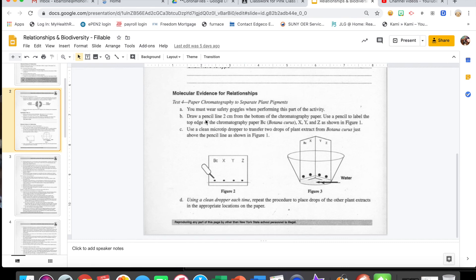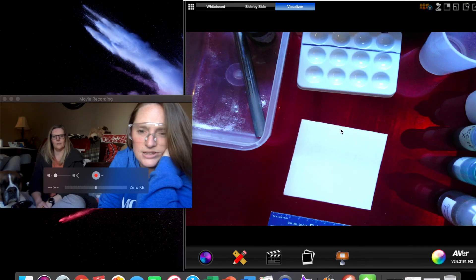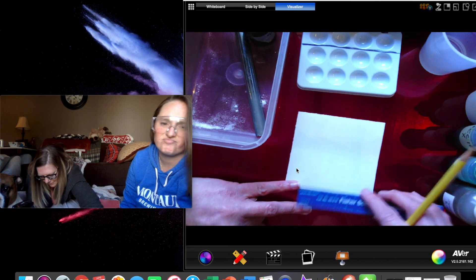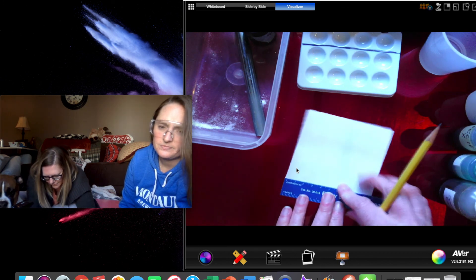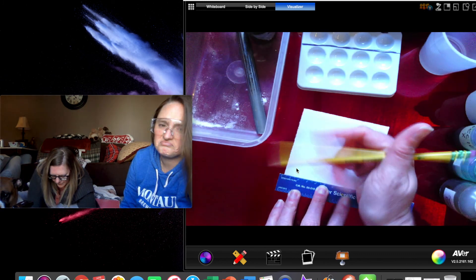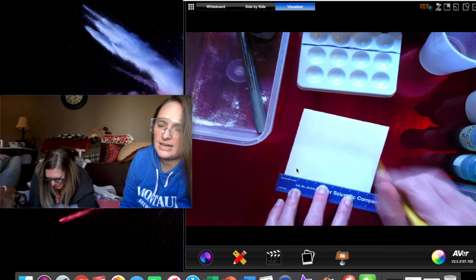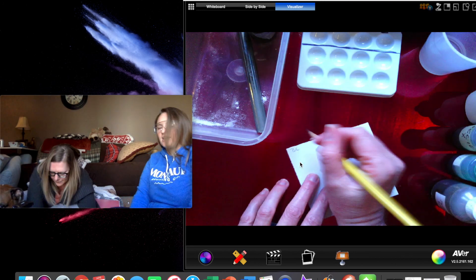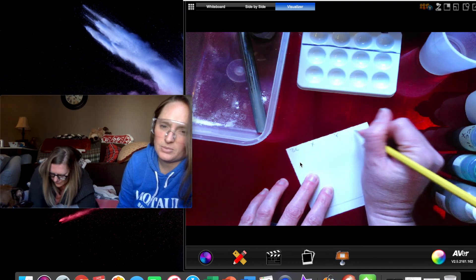Draw a pencil line about two centimeters from the bottom of the chromatography paper, and use a pencil to label the top edge BC, X, Y, and Z as shown in figure one. I'm going to have Jen draw the line — it's about a pinky's length from the bottom. Then across the top she's going to space them out so you have BC and X on the first half and Y and Z on the second half.